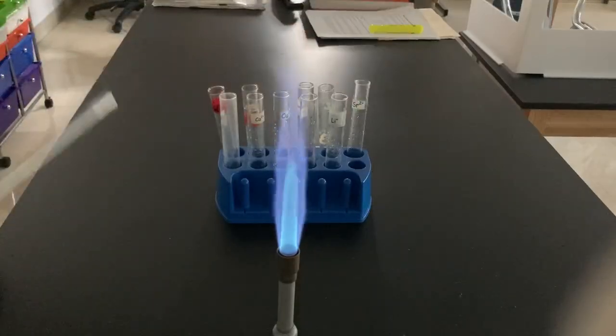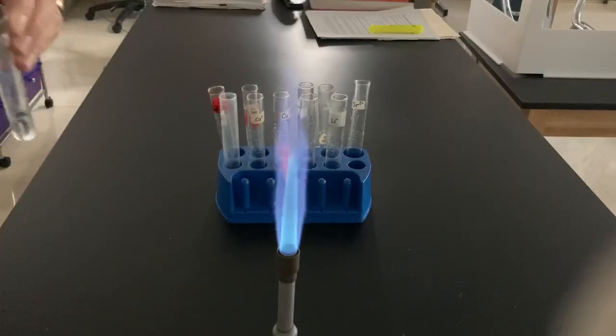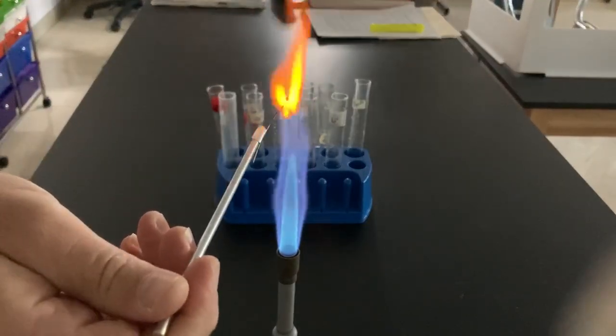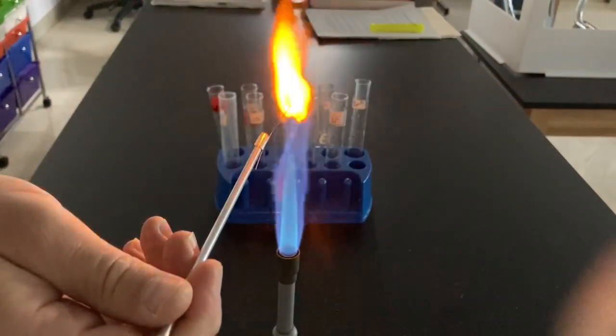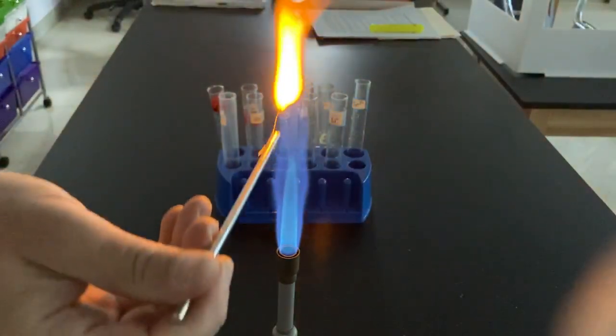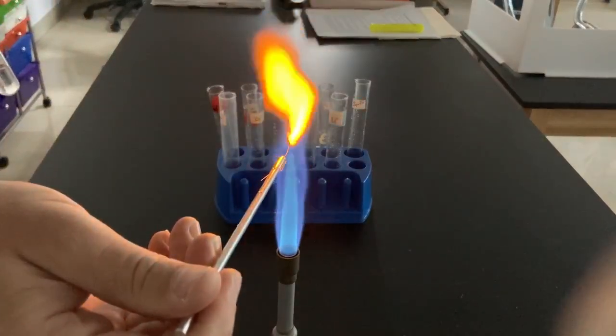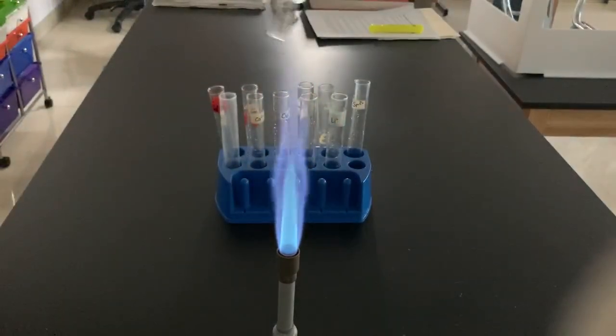And let's come back to our friend sodium real quick here. Sodium is kind of a tough one to see. I'm going to look for that initial coloring there. Kind of a brightish orange, and then the wire takes over. It's kind of hard to distinguish sodium from the wire, but sodium is really kind of a yellowish orange — a little hint of yellow there at the beginning.